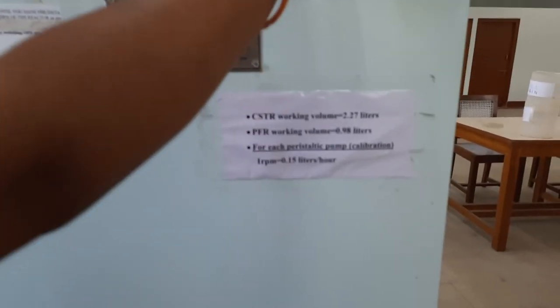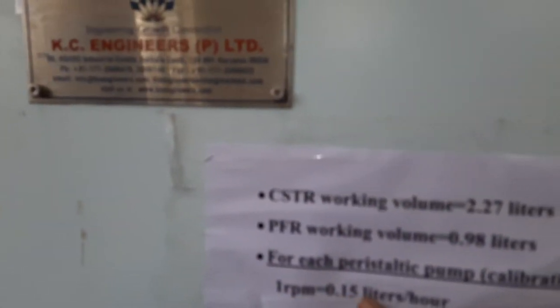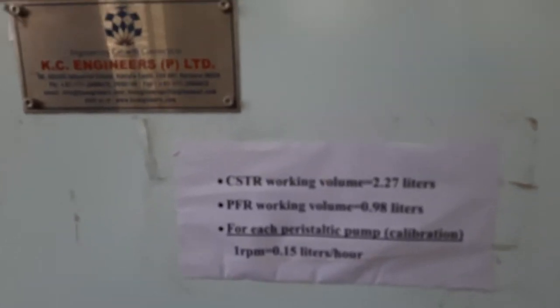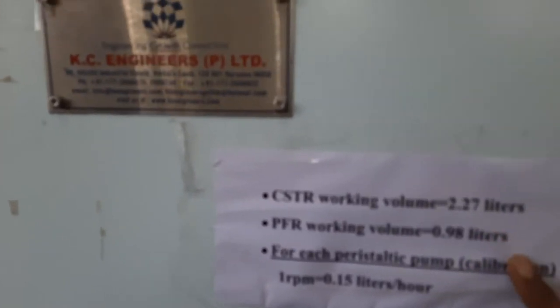So we should know what is the conversion to liters per hour, right? So 1 RPM is equal to 0.15 liters per hour. This we have to make use of, and the working volume of the plug flow reactor is 0.98 liters.